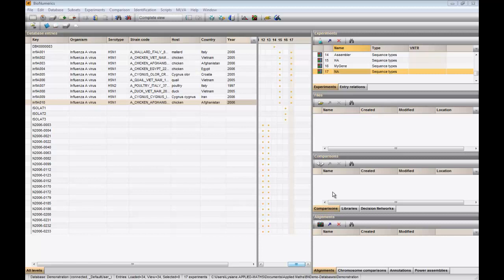In this video, we will start exploring the functionalities offered in the Alignment window. For the calculation of multiple sequence alignments, sub-sequence searches, and mutation analysis, the Alignment window forms a more powerful alternative to the sequence analysis features available in the Comparison window.